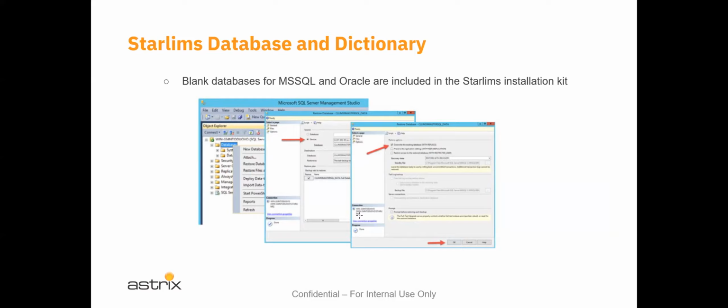I thought about this after the training, but this is important. I should have typed it in here in big bold letters. It's important for anyone related to a STARLIMS system as a consultant to understand that STARLIMS itself is really a toolbox. It's not a product like Microsoft Office or Microsoft Excel, for example. It's really a toolbox that allows you to create applications, and they happen to have provided a few applications for the different business and industry verticals that are out there.